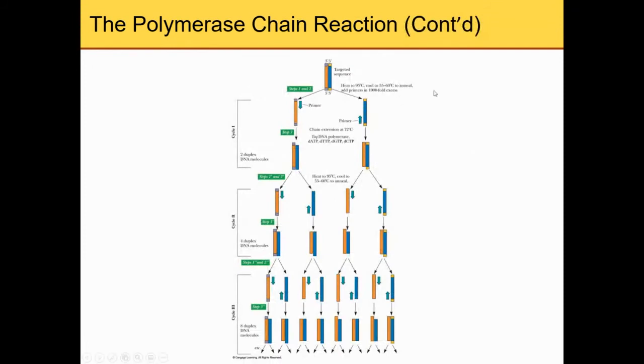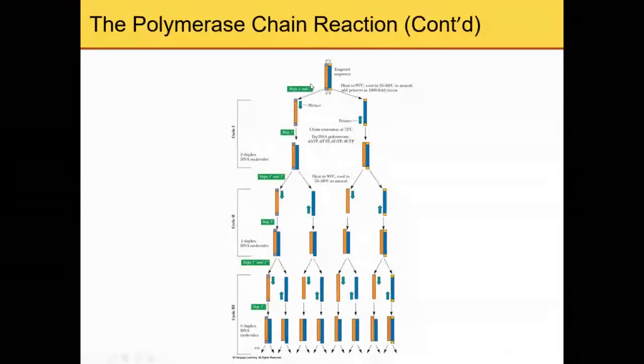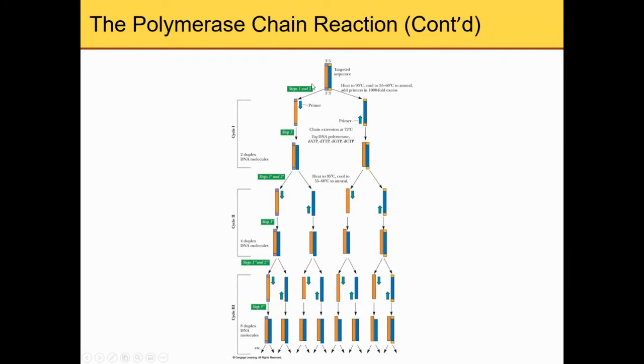Basically, PCR reaction requires the oligonucleotide primer that is complementary to the template DNA, and so you can see the primer, they will be able to synthesize a new DNA strand, right? And then the PCR reaction includes 3 steps. You have the denaturation, which means you need to denature this template DNA, and step 2, annealing, the primer anneals to the template. Step 3 will be the extension. Extension, I mean the polymerization.